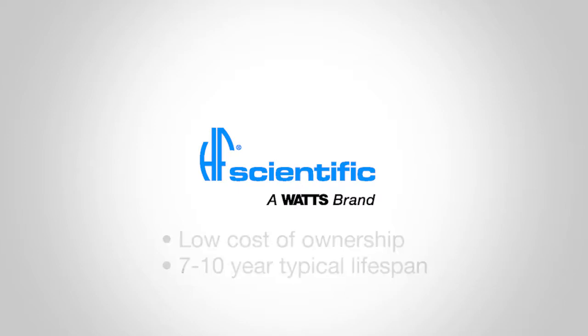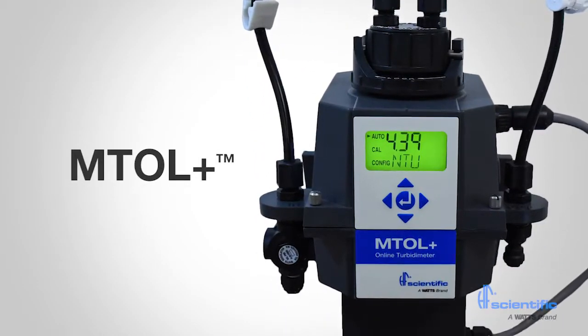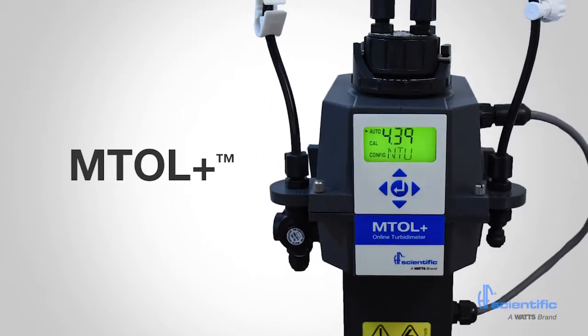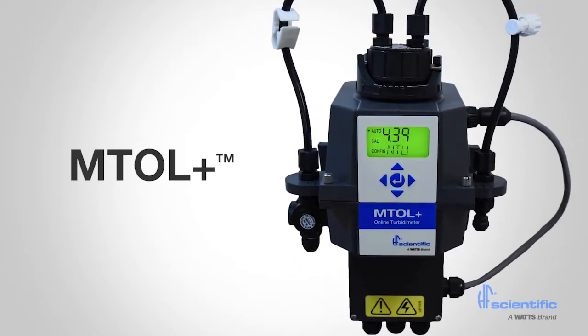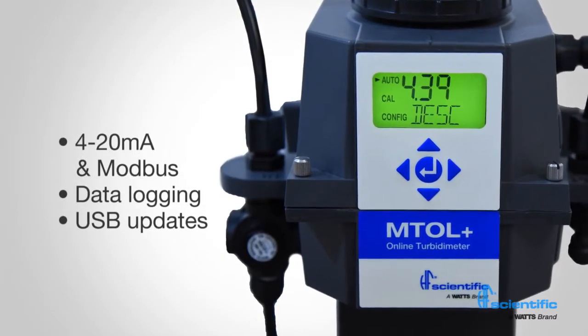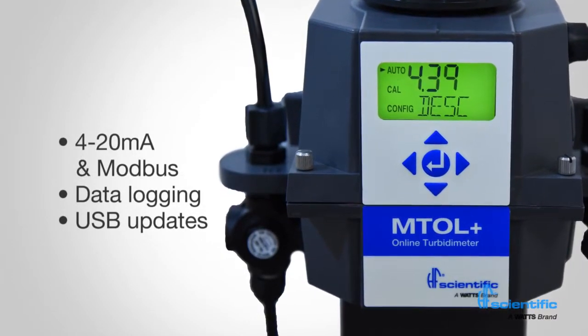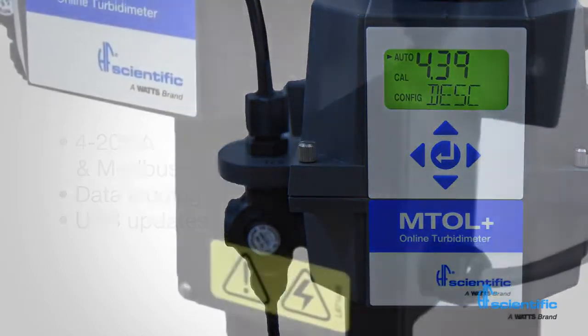This video features HF Scientific's latest turbidity meter, the MTOL+. While this instrument has much in common with the previous generation, it has been redesigned with a 32-bit ARM core processor to allow for enhanced features. Other new features include simultaneous 4-20mA and Modbus outputs, data logging of readings, USB software updates, and USB data downloads.